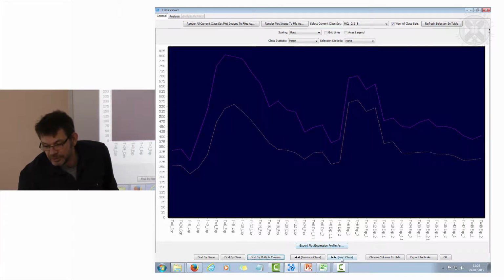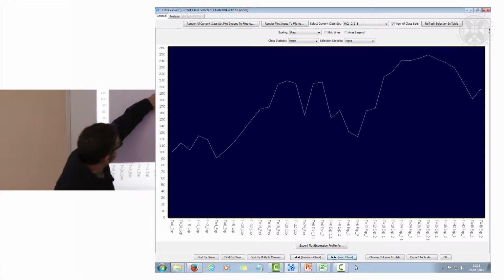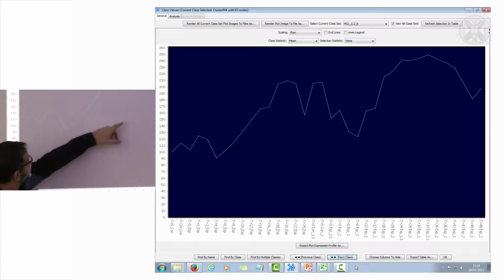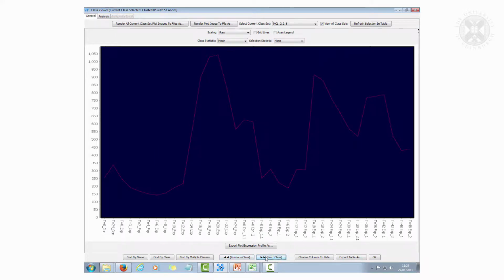Okay, I'll just wander through here. So here we have a set of genes which are going up later, peaking around 22 hours. They're interestingly quite high in the controls in that sample. Here's something that goes up very much around 12 hours, a stonking big increase.